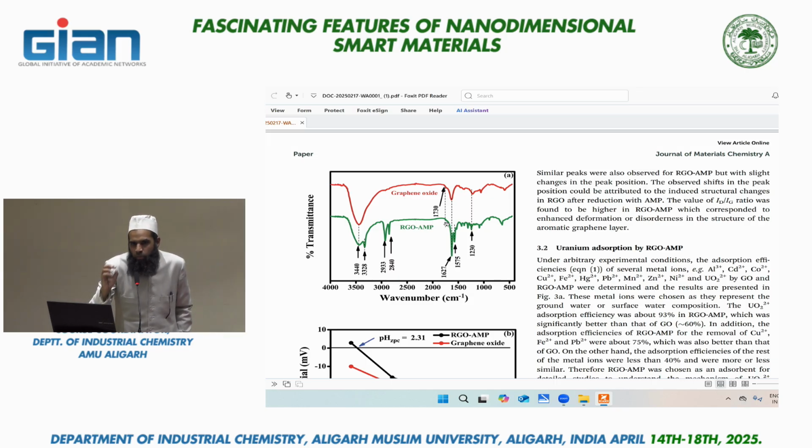And we also confirmed this experiment by using a specific titration called Boehm titration. Many of you, I think, are hearing about Boehm titration for the first time. This is a titration in which we can quantify the concentration of the acidic functional groups present on the graphene. So it is not the time to define this.